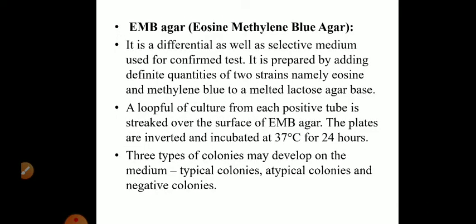On EMB agar, why do we get typical, atypical colonies and all? It is again a differential medium as well as a selective medium used in the confirmed test. It is prepared by adding definite quantities of stains, namely eosin and methylene blue, to a melted lactose agar base. It contains 2 stains, eosin and methylene blue, added to a melted lactose agar base.